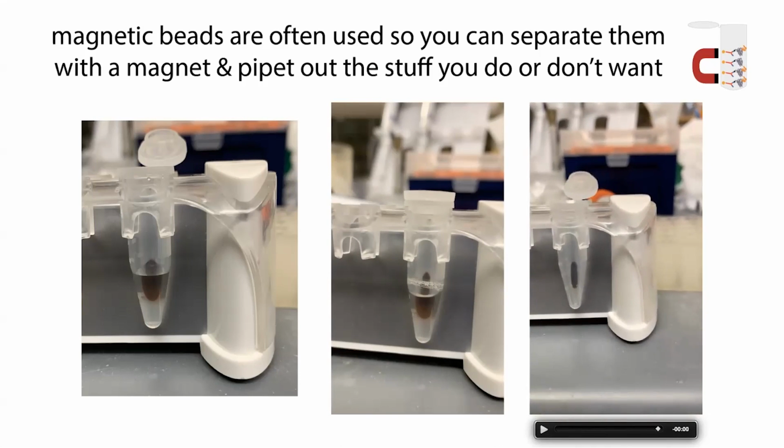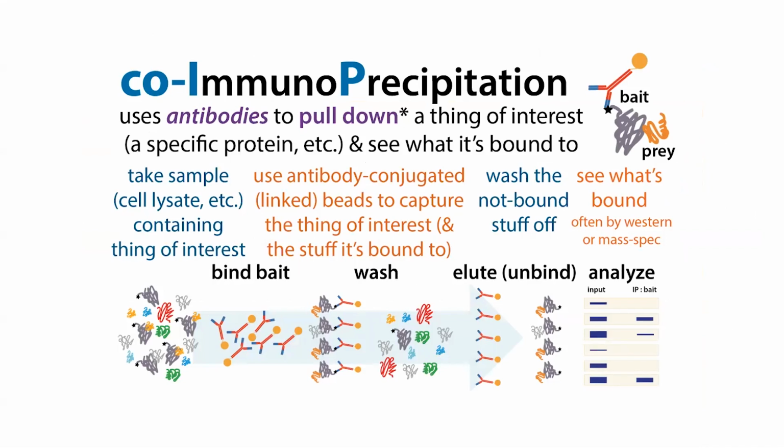Alternatively, you can use non-magnetic beads, often agarose beads, and you can just do a gentle centrifugation step in order to pellet out those beads and remove the liquid. Basically these methods allow you to separate the beads from the liquid and therefore separate the bound things from the unbound things. The bound things should only ever be your bait, as well as what the bait's bound to. Everything else should wash off.